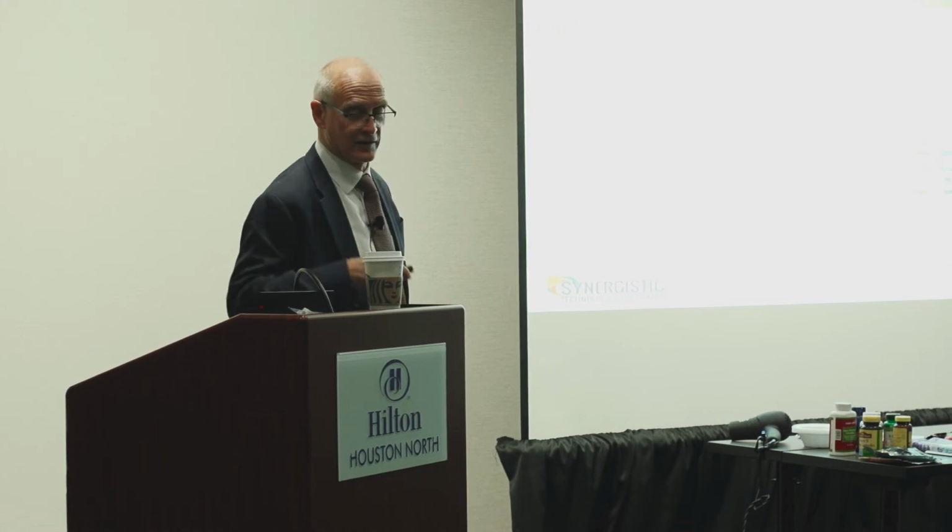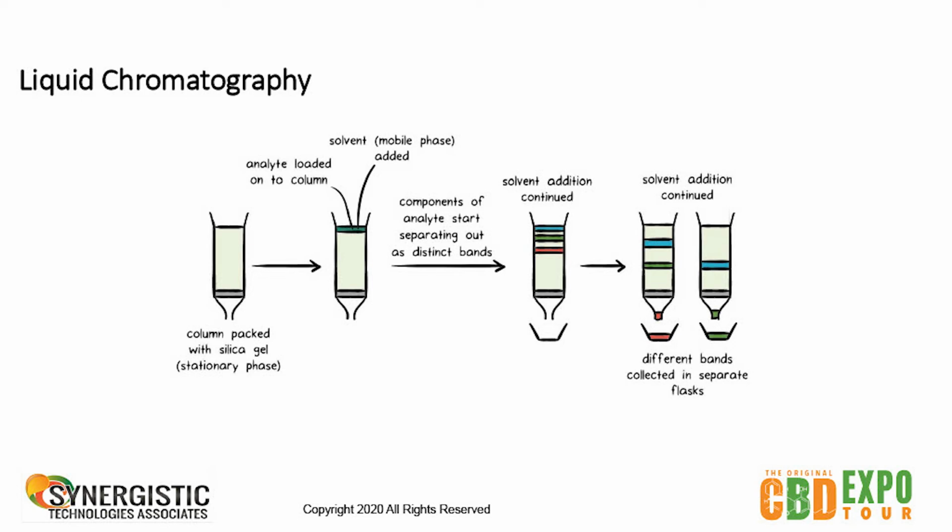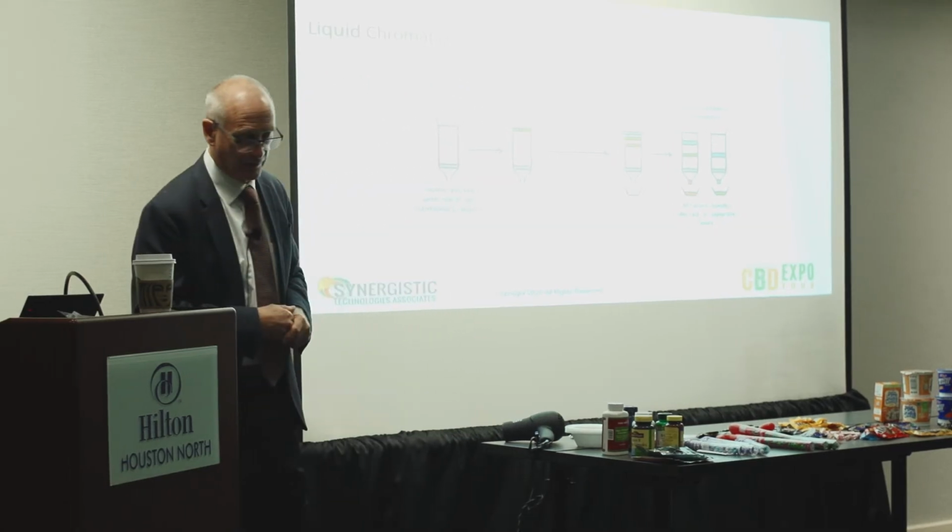When you look at that and you look at what people talk about with column chromatography, you now have a column that's packed, and you have a solvent that you've already placed in there, and versus having a dot, you actually put a layer of material on the top of that, and it will do the exact same thing. So there's your blue, red, green. They're coming off at different times. They travel at different rates. So just like when you're doing the capillary action up a thin layer chromatography where they're moving along with the solvent, the same thing happens here, except it's going in the opposite direction, and you're able to collect them. That's what the chromatography does.